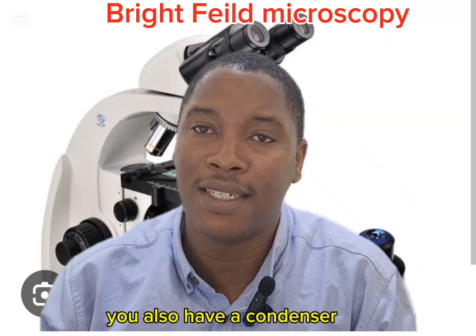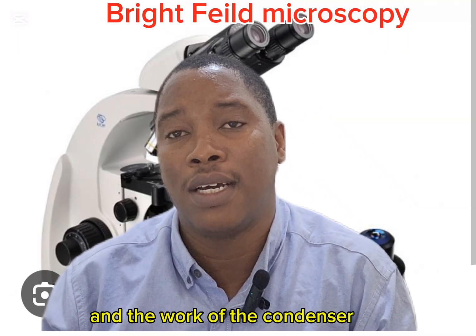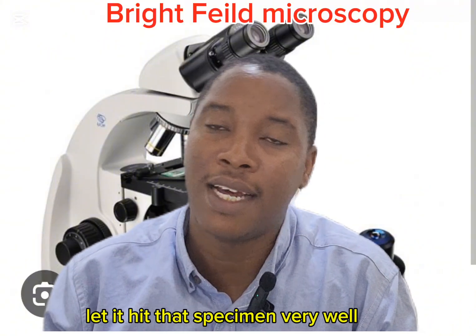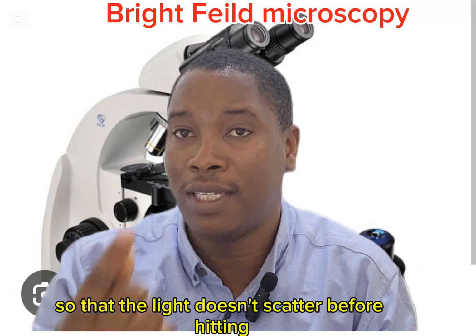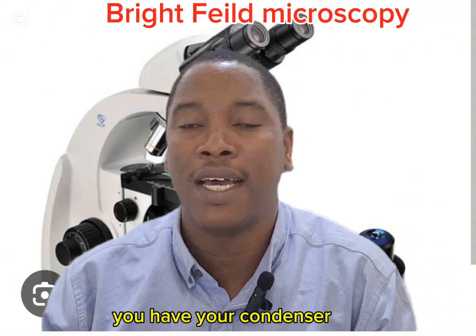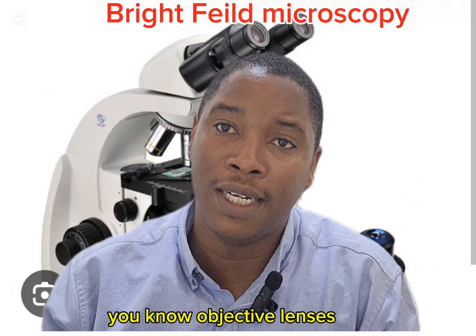You also have a condenser. The light is sent through the condenser, and the work of the condenser, which you have in many light microscopes, is to focus the source of light and let it hit the specimen very well so that the light doesn't scatter before hitting the specimen. Then you have a series of objective lenses.